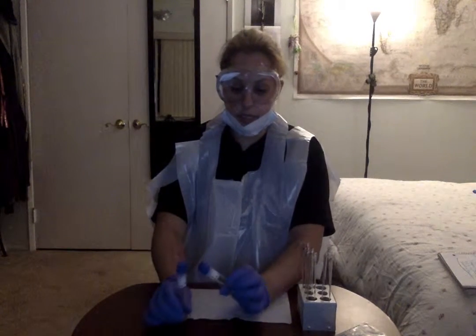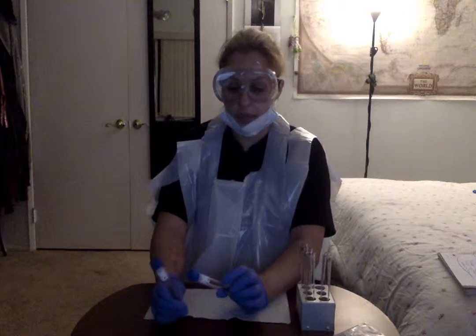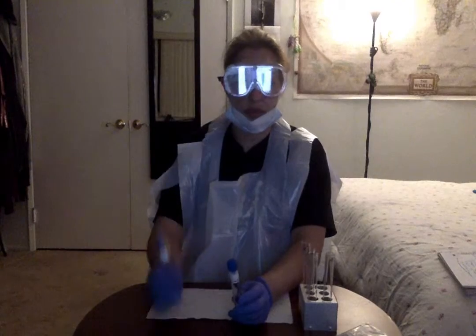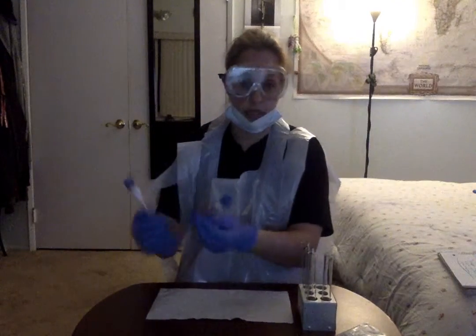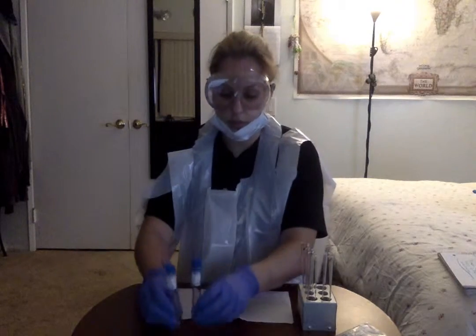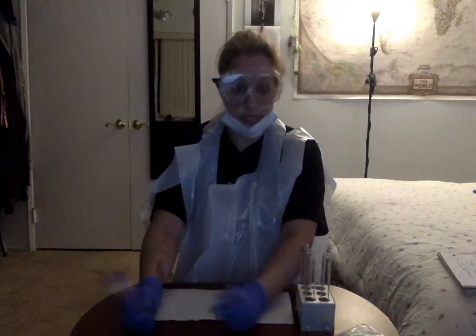I did actually let these ones incubate for 72 hours instead of 48 because my E. coli didn't really develop much turbidity. The S. epidermidis did a little bit, but I thought maybe I could let them grow still a little bit. So 72 hours incubation for these, which leads me to today actually.